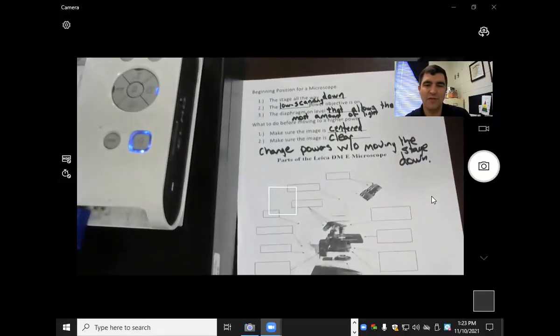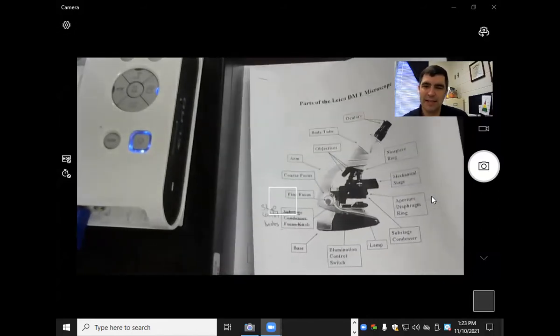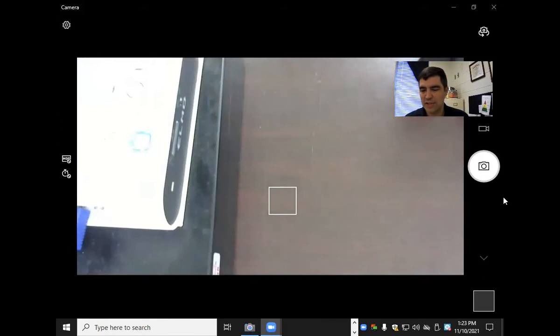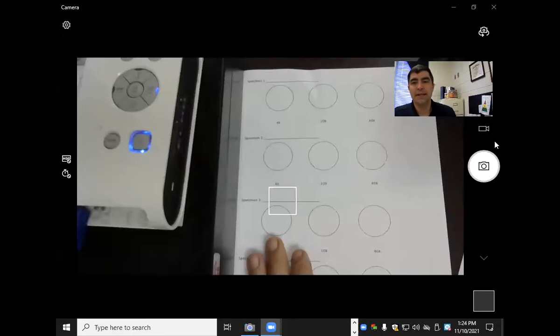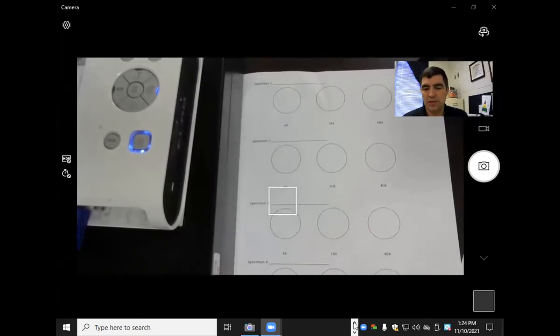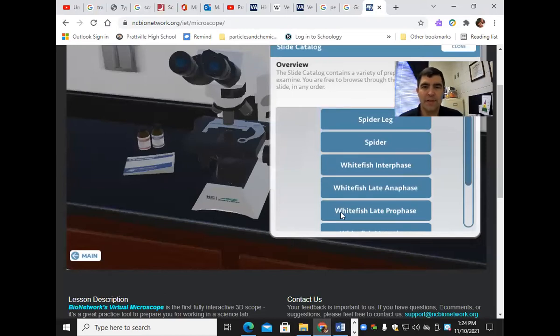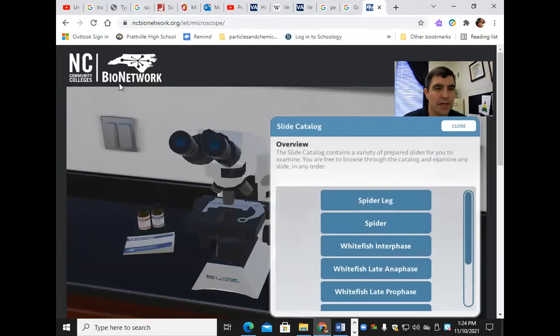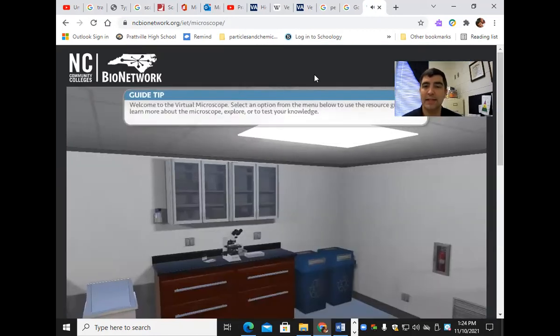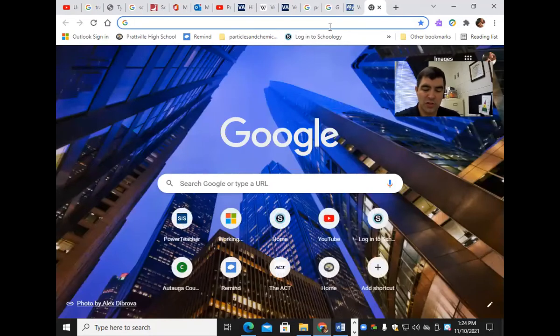After you've copied that down and filled out all the boxes, what we're going to do next is on the back side. You're going to go to this microscope website called NC Community College BioNetwork. I typed in 'virtual microscope,' pressed enter, and it's the first one.